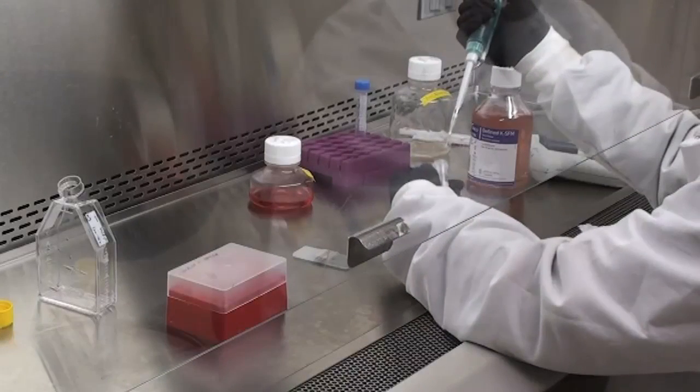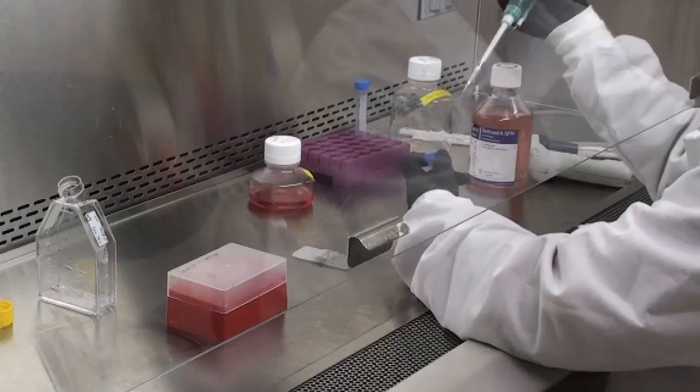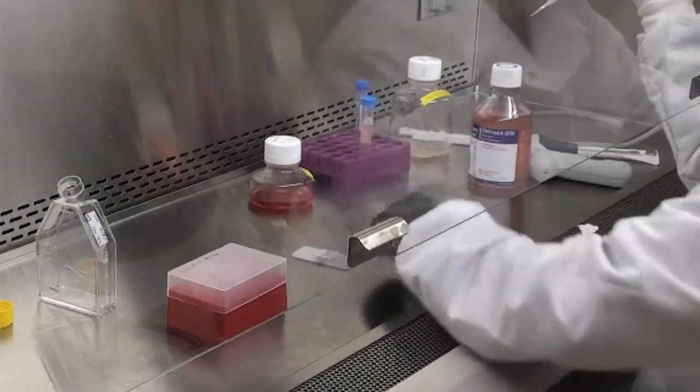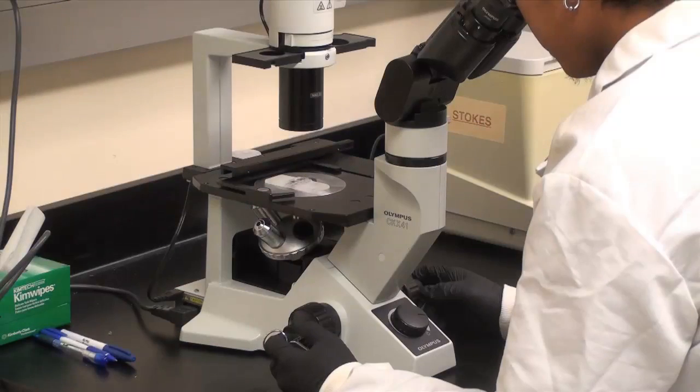Take the hemocytometer and place a glass cover slip over it. Take a small portion of the cell suspension, 10 microliters, and insert it into the groove that will spread the cells across the hemocytometer. The hemocytometer displays a grid when viewed under the microscope and allows us to count the approximate number of cells in the suspension.